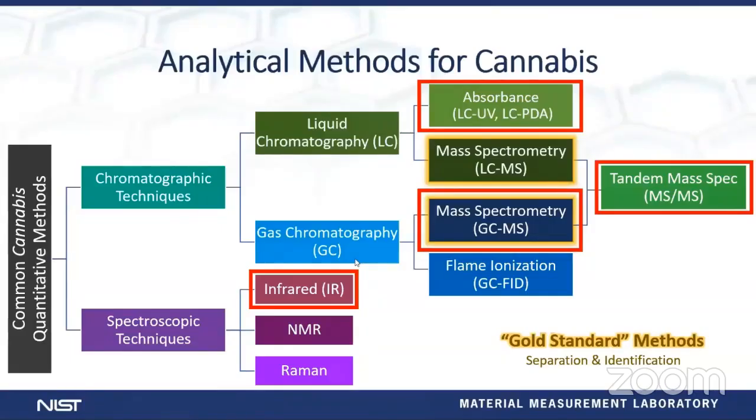We have done a lot of work with infrared spectroscopy using benchtop instruments, but also potentially portable instruments. I'm not going to have the time to go into that here today, but we are in the process of submitting a paper on a lot of the characterization work that we did over 4 different types of portable IR devices and benchtop instrumentation. So please look forward to that if you are interested in that information.